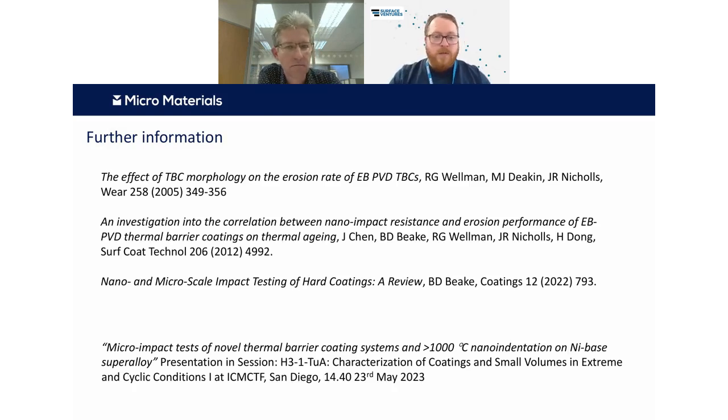I think for the moment, just whilst people are typing questions in, just a quick one from me to get us started. So you mentioned you're going to look at different coating types, microstructures, and novel coatings. Can you tell us anything about what types of structures or microstructures? Well, I think the interesting thing is we're going to look at if we can combine retaining the columnar structure, but also with a degree of multi-layering in this plane as well. So it's that combination of those two types of structures, and we may be able to compositionally vary, have layers of more erosion resistant but thermally less good thermal conductivity layers. So there should be some optimization based around that.